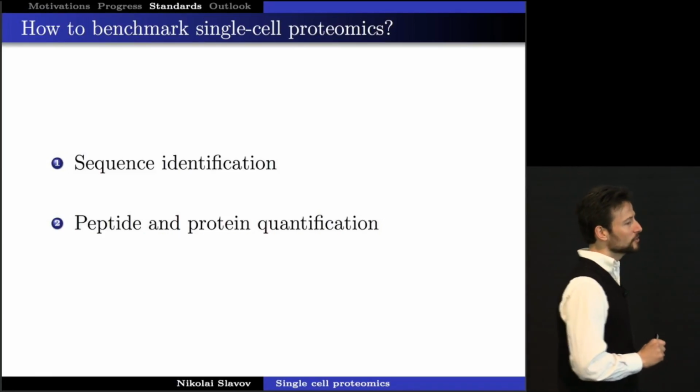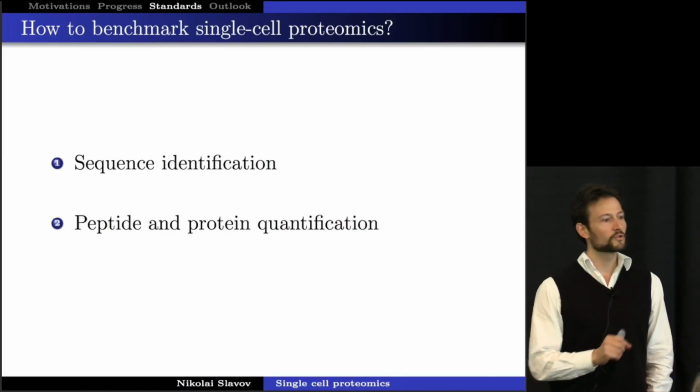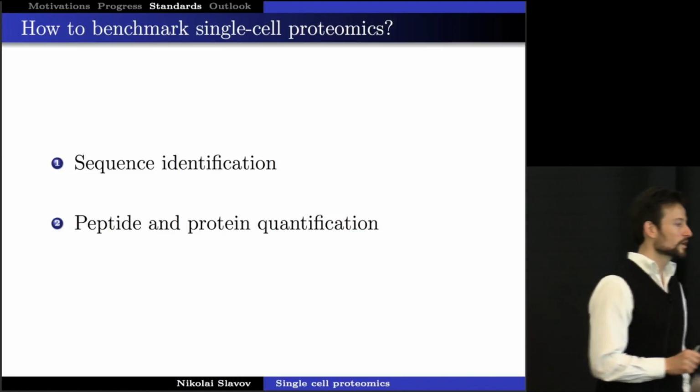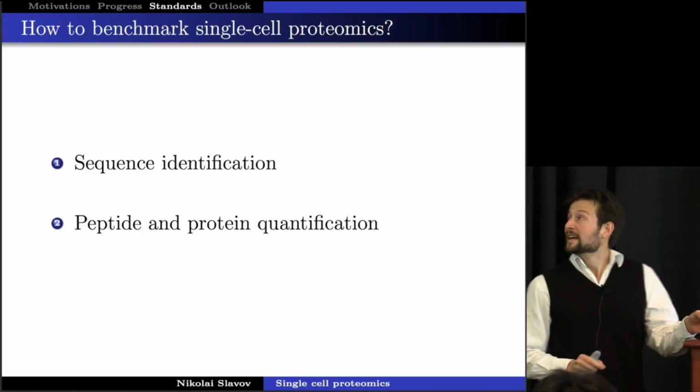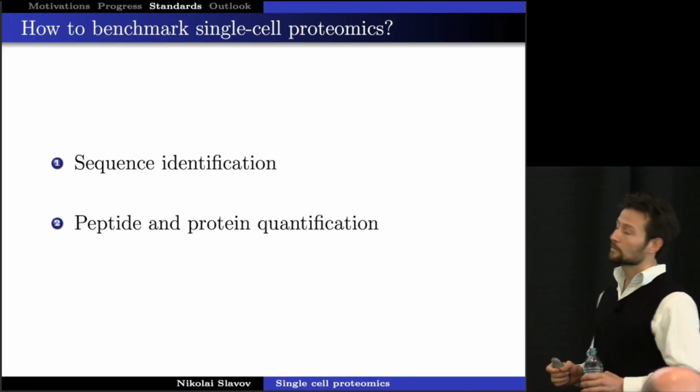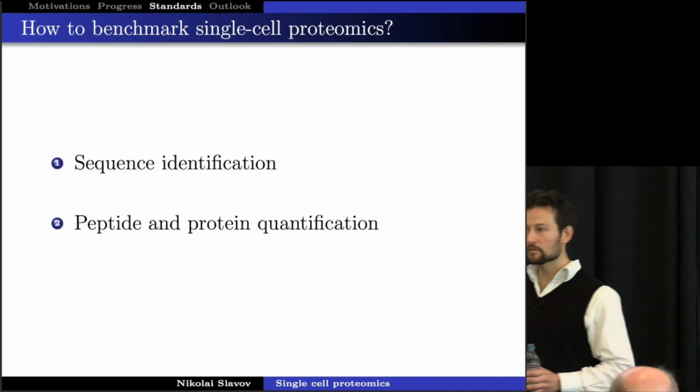We cannot just assume that we can apply the tools that we have for 1 million cells, and they will work with single cells. We certainly have to rethink sequence identification and peptide and protein quantification. We have to be very careful.